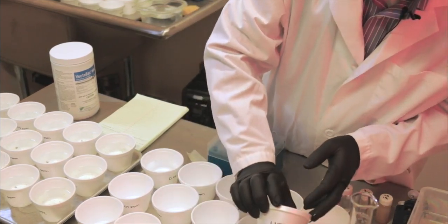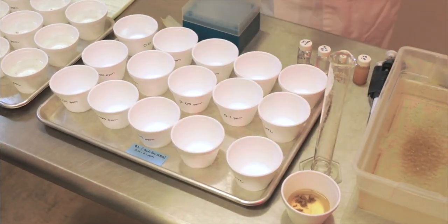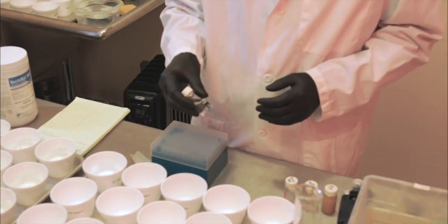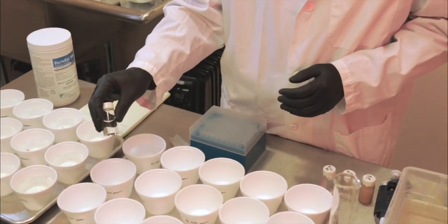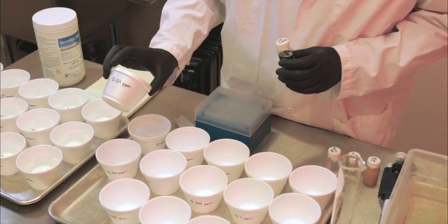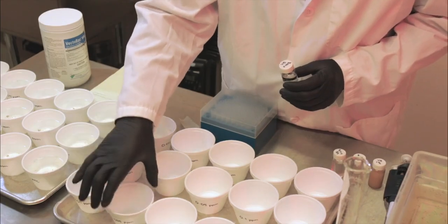Of course, in the control, you're not going to put the pesticide. So the calculation would be which vial to use and how much to add to that cup, which holds 100 ml water, to give you a final concentration of 0.01 parts per million. So it's simple math, but it can be confusing.